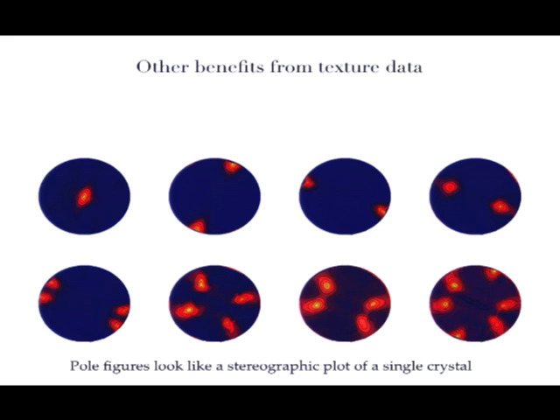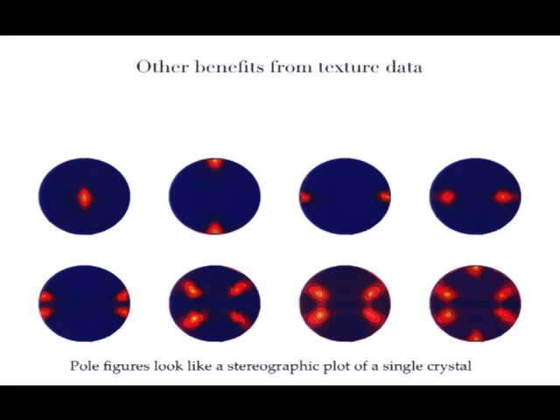So this one could be oriented like that. We do that as well, and for all the other ones. And now we can easily see that there is symmetry in our pole figures. Unfortunately, what we see is the sample symmetry, because by orienting our crystals, we induce symmetry mm2.